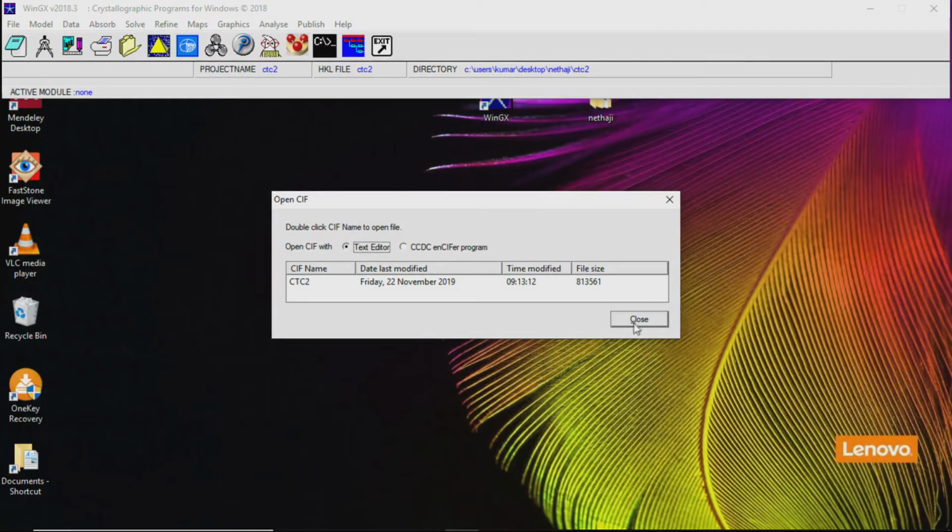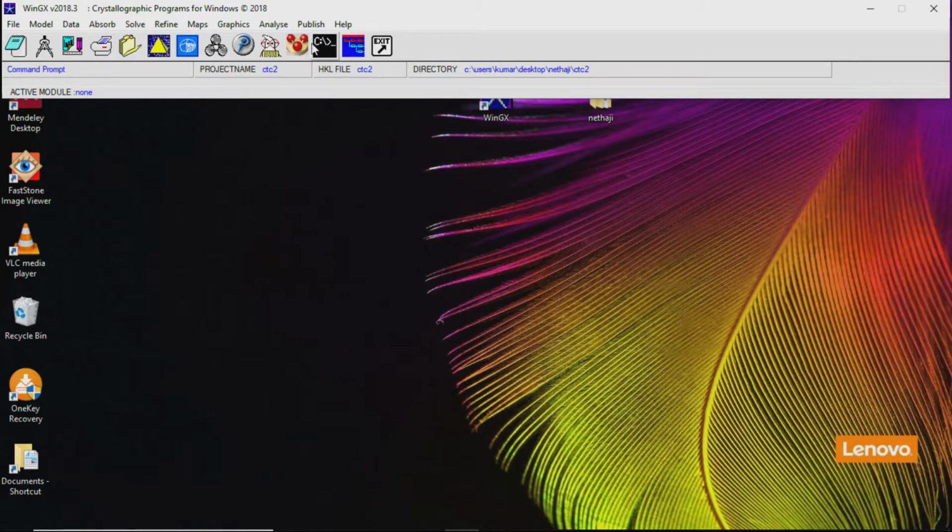Okay. So, like this one can complete the structure, you can use the CIF and the checkCIF and the Platon, Mercury diagram, all those things for completing your structures.